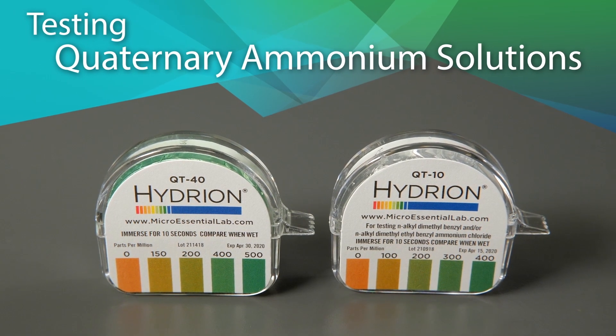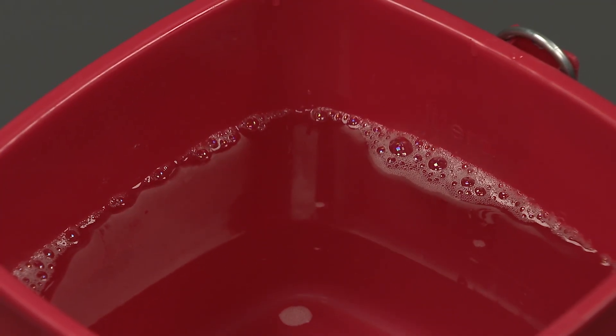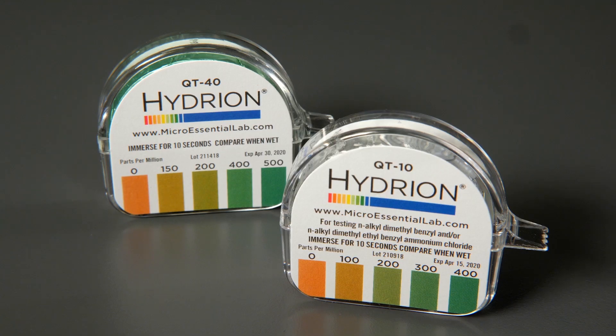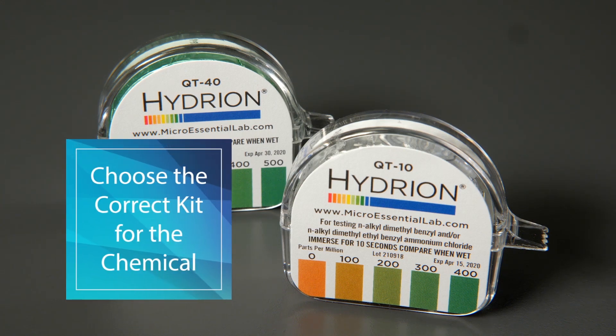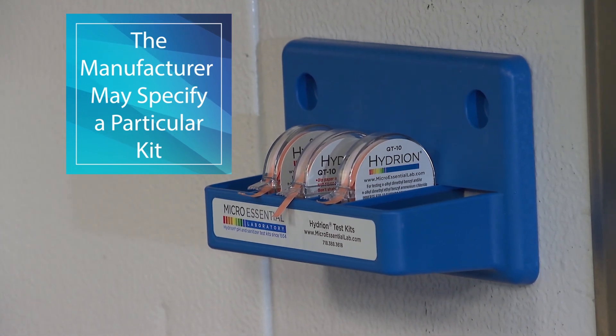Testing Quaternary Ammonium Solutions. Prepare the QUAT solution according to the manufacturer's instructions. When testing the accuracy of its dilution, be sure to choose the correct kit for the chemical in use. The sanitizer manufacturer may specify a particular kit.